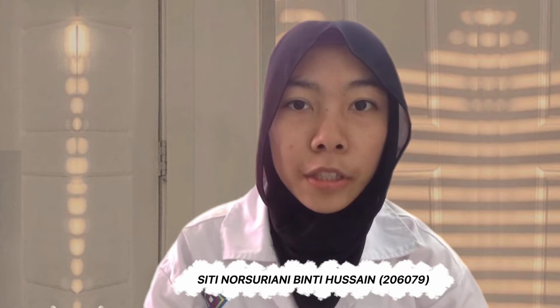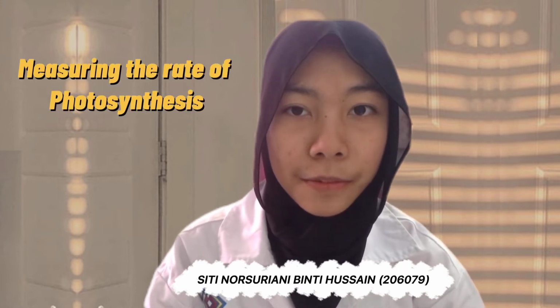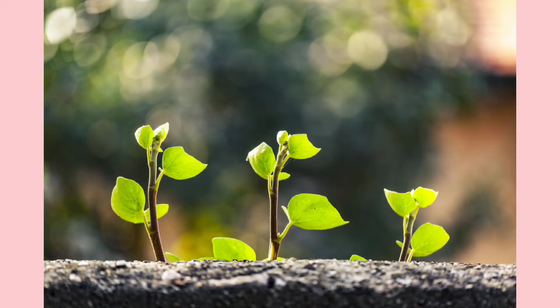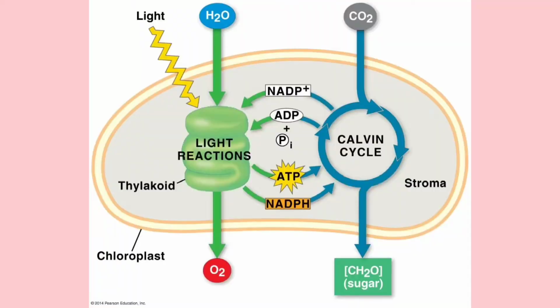Today, I will do an experiment on measuring the rate of photosynthesis. Photosynthesis is a process that provides nearly all the energy and organic carbon that is required by living organisms. Photosynthesis in the leaf of a plant can be divided into two stages, which are light reaction and Calvin cycle.